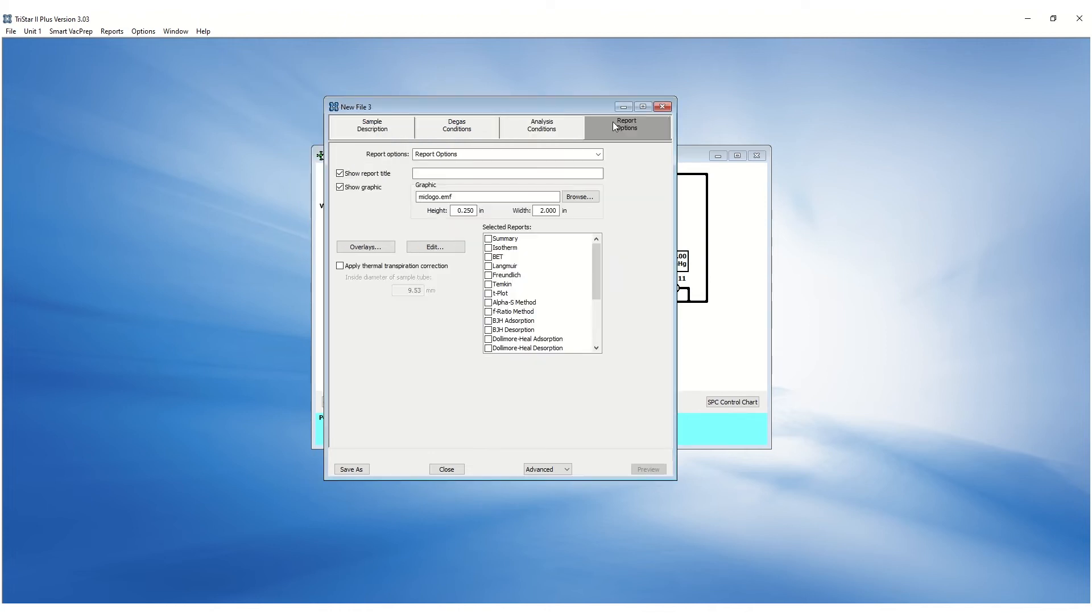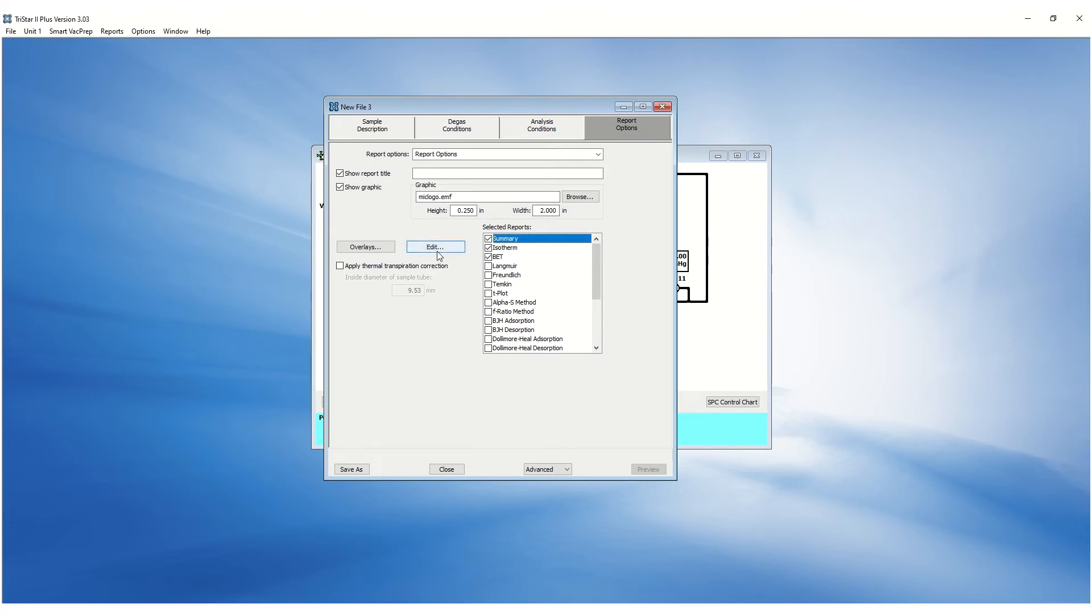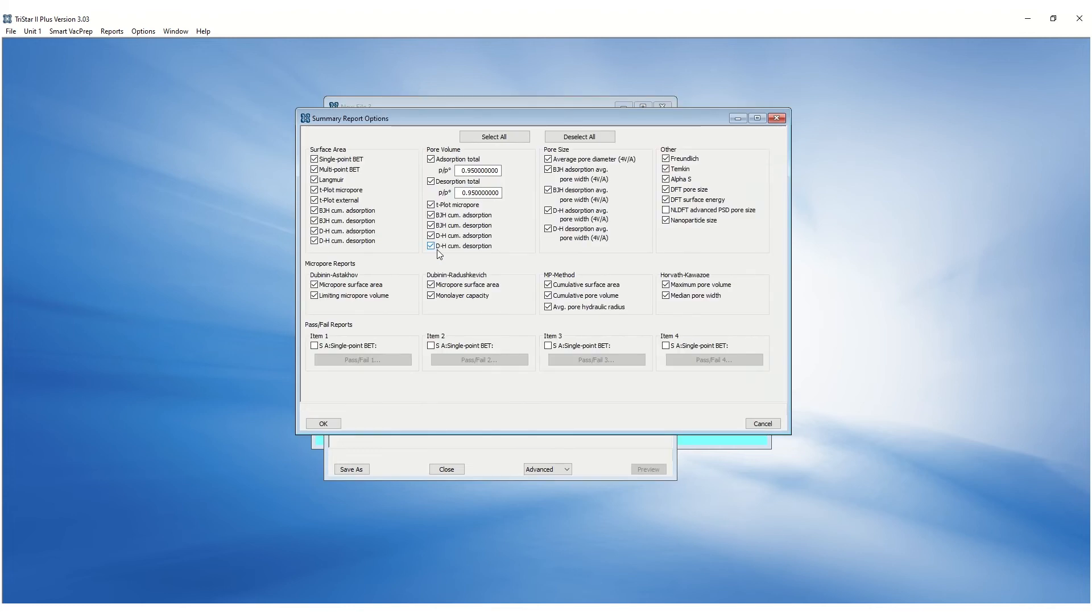Reports can be selected in the Reports tab. To select a report, place a checkmark in the checkbox. To edit a report, highlight the report and click the Edit button.